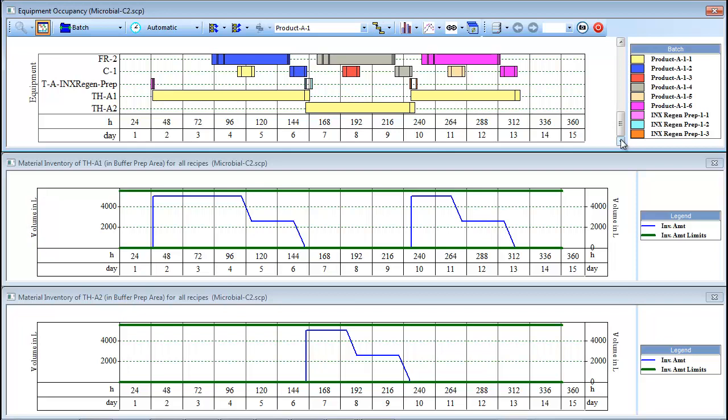I will follow the same process for the other holding tank. Here you can see the inventory levels within the individual holding tanks linked with the EOC. Notice that tank THA1 is used to hold batches 1 and 3 of the buffer, while tank THA2 is used to hold batch 2 of the buffer. For additional details on storage unit specifications, please refer to case C2 in the README file associated with this example.